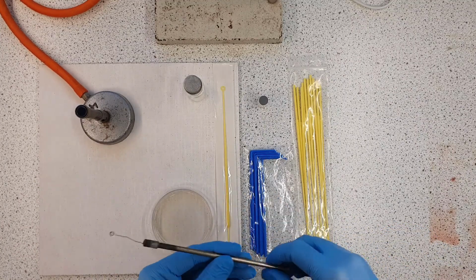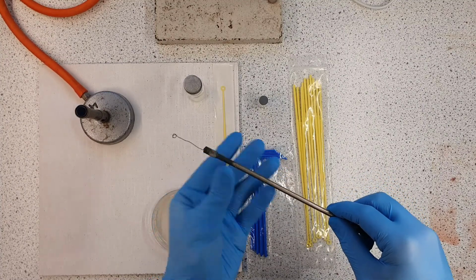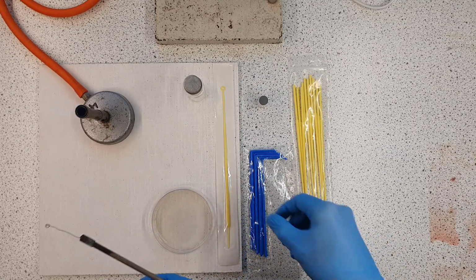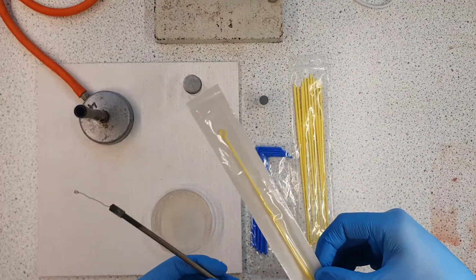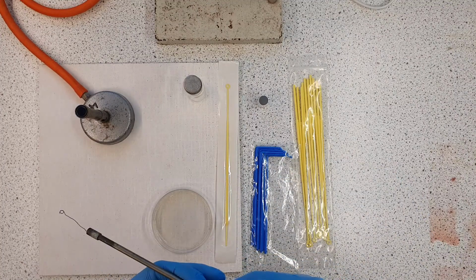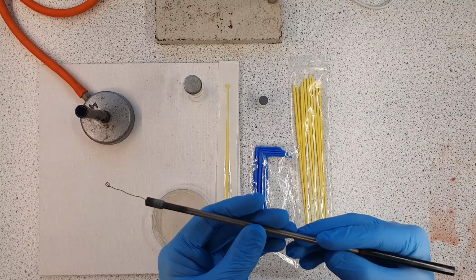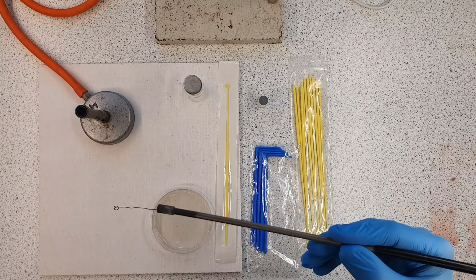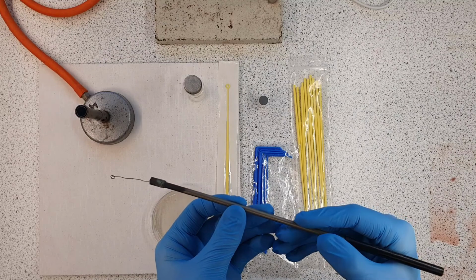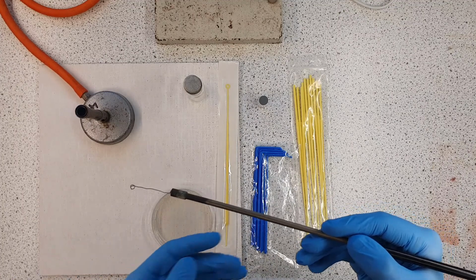Now, when it comes to sterilising metal loops, which is what we've got here, a wire loop on the end of a pole, it's a very simple process. You probably won't be required to use this technique very often, because nowadays we often have disposable single-use plastic pre-sterilised equipment, but it's a good protocol to know just in case. So before and after we touch any bacteria or any medium really, we want to make sure that this is as sterile as possible, both in terms of preventing contamination of our sample and in terms of preventing spreading of any pathogens when we've finished.